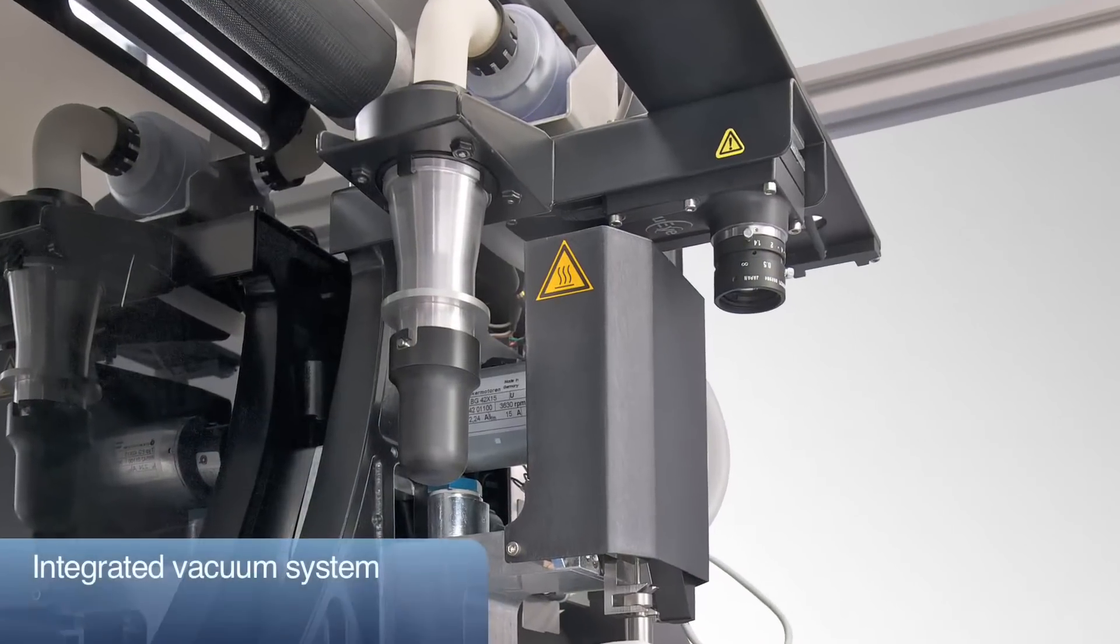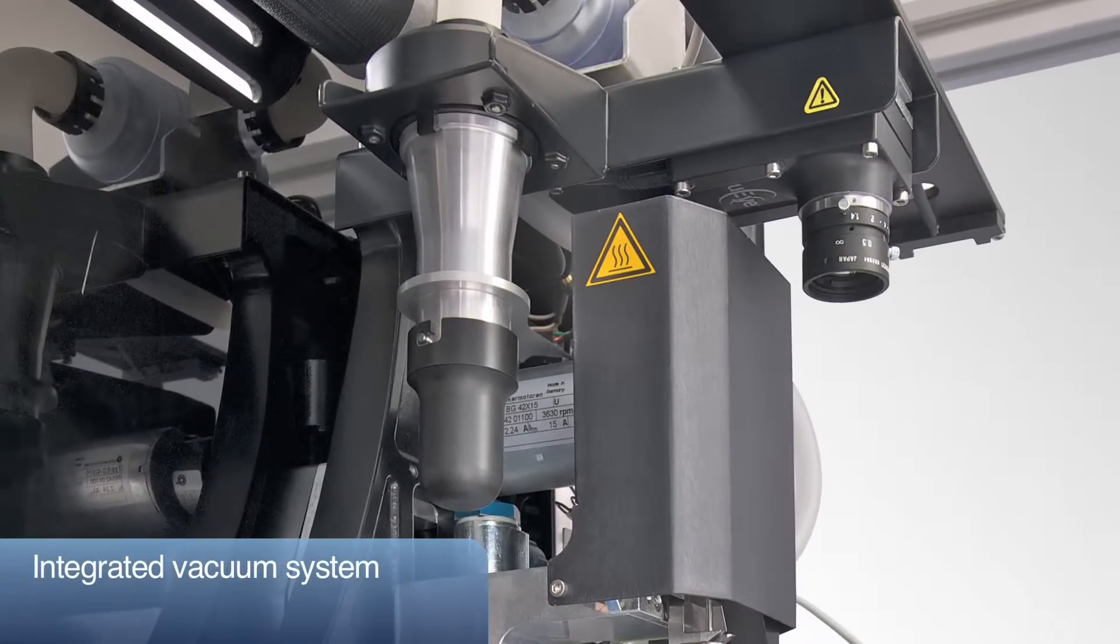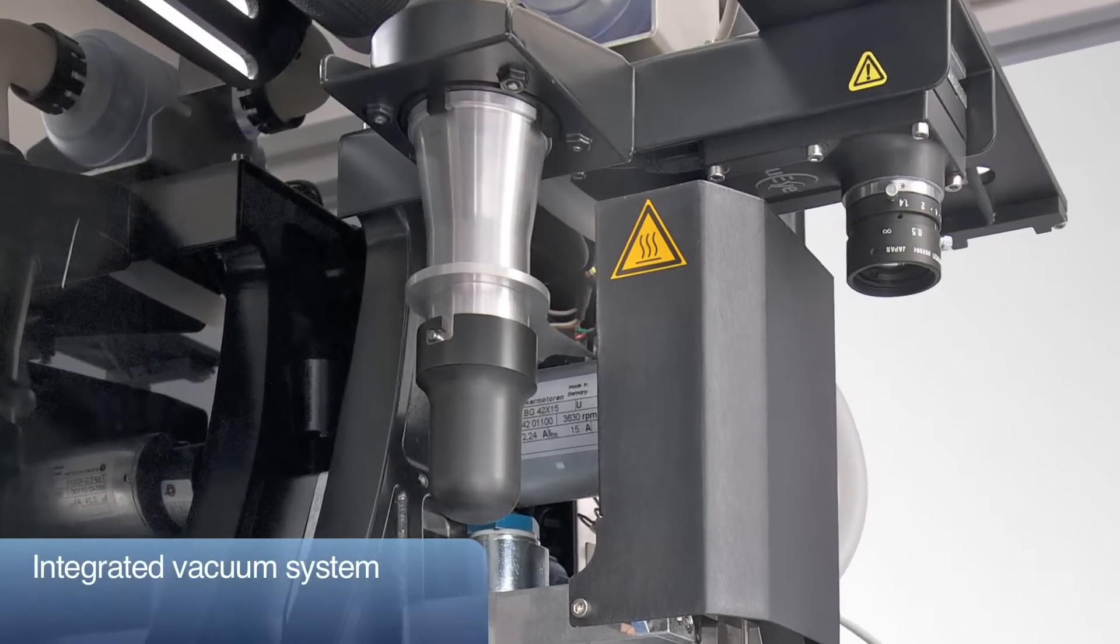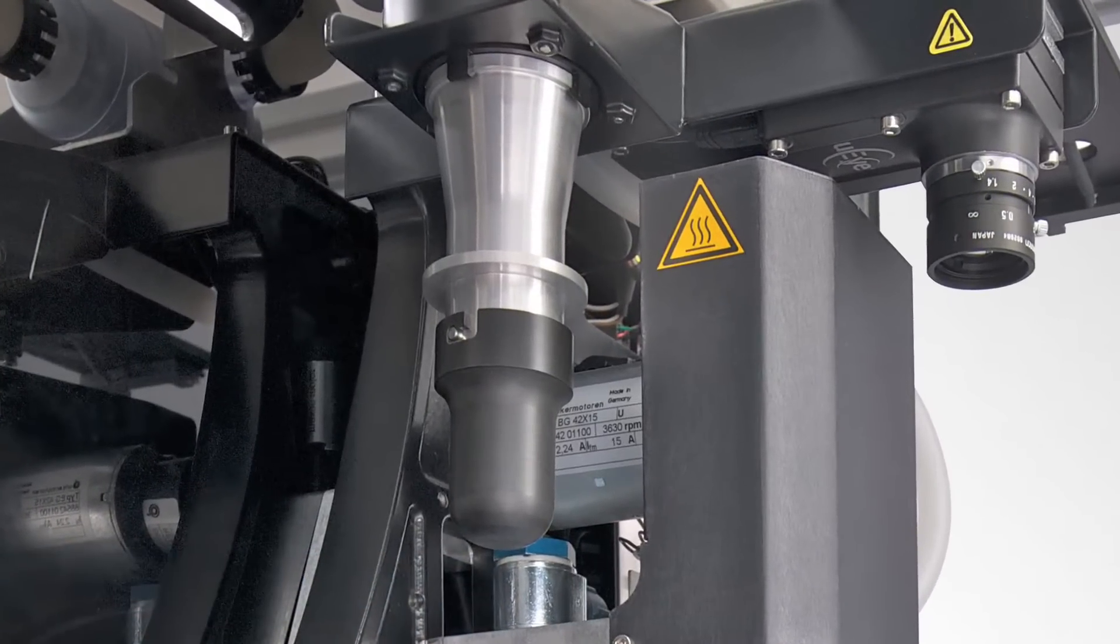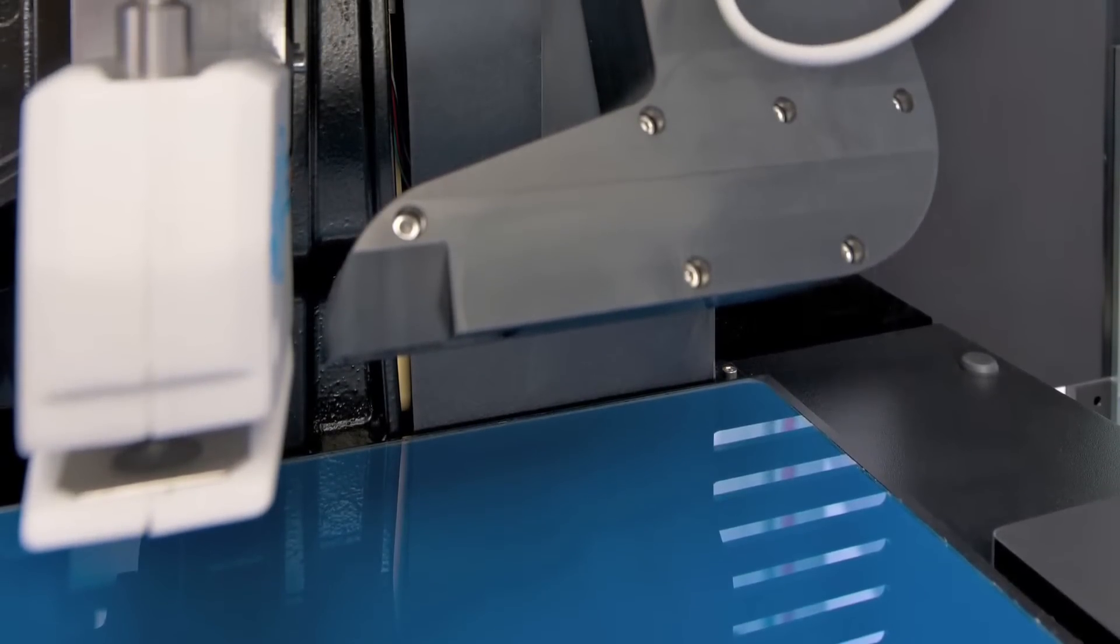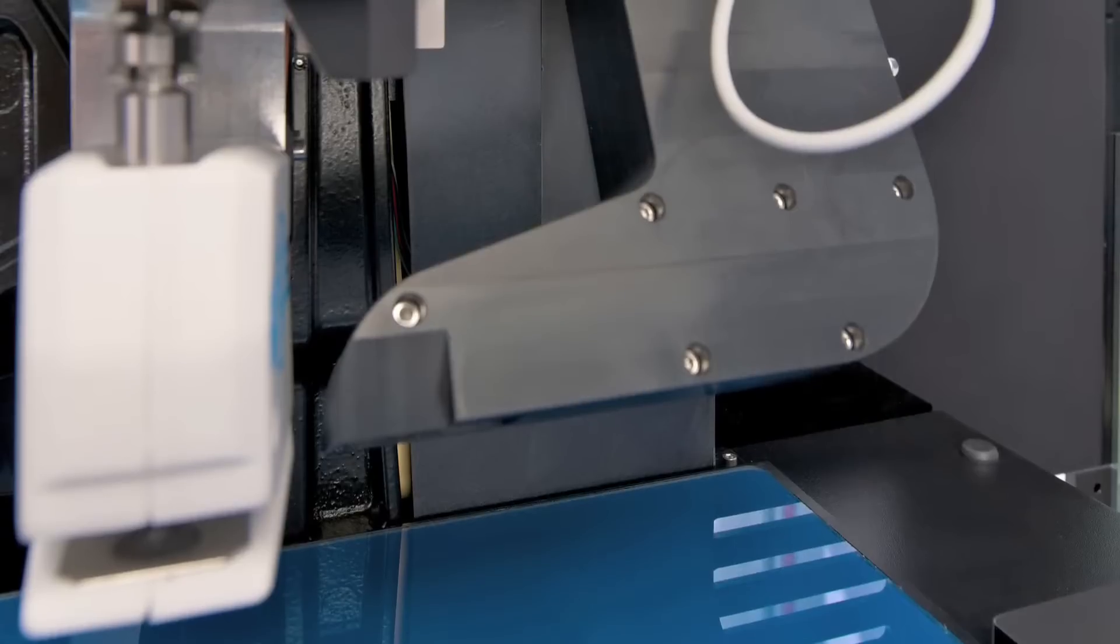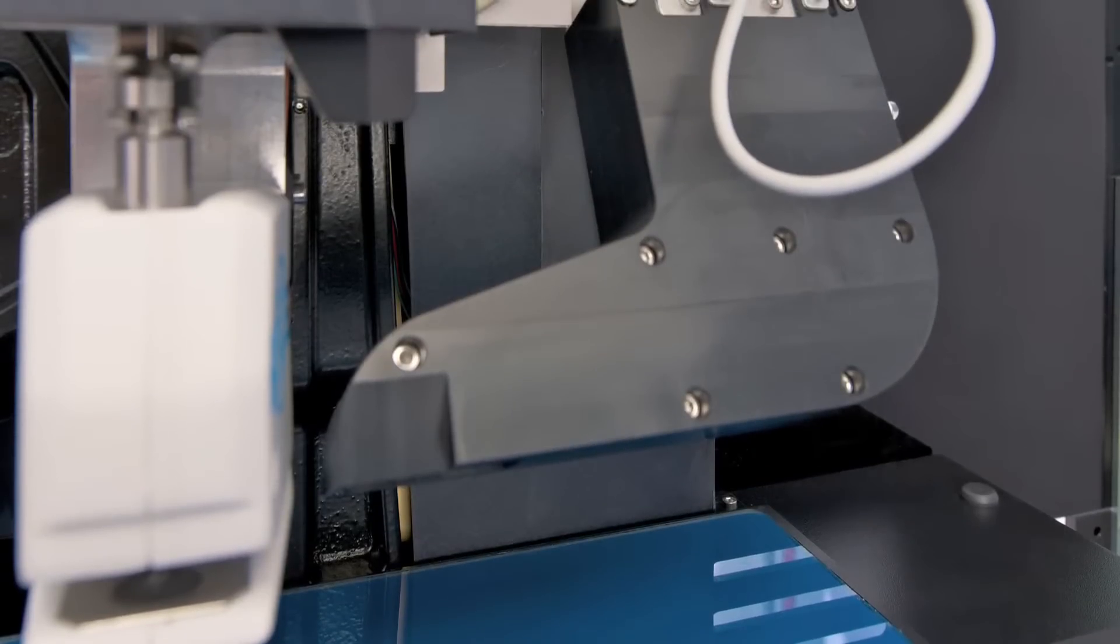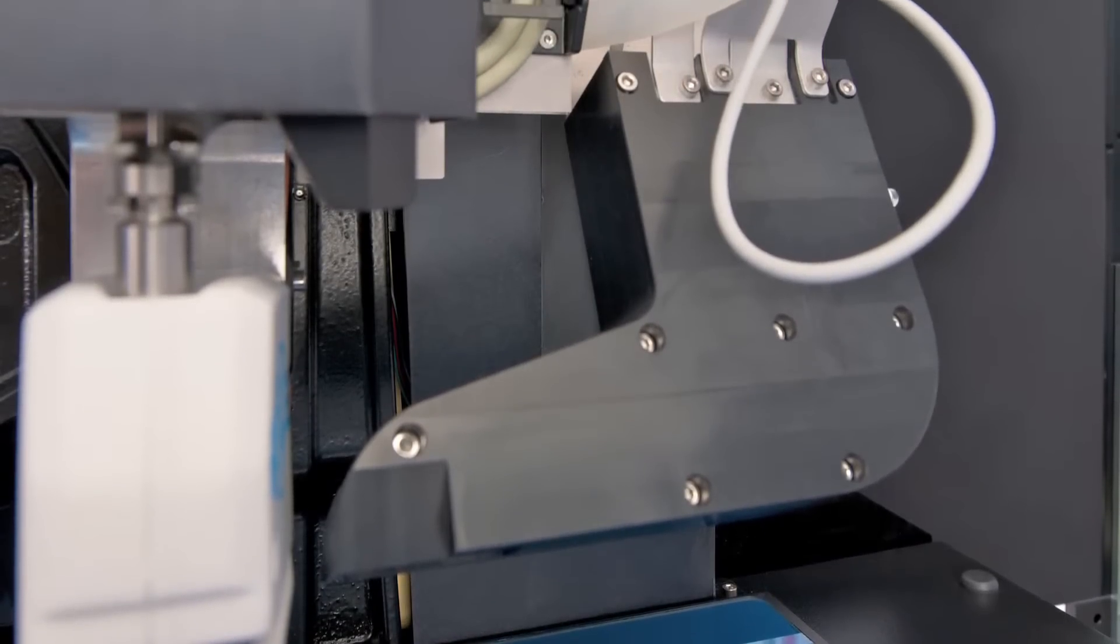A vacuum system is integrated to remove dust from the punching action in order to prevent cross-contamination. An ionizing system removes statics from the microwell plate to ensure accurate dispensing of the punch discs into the wells.